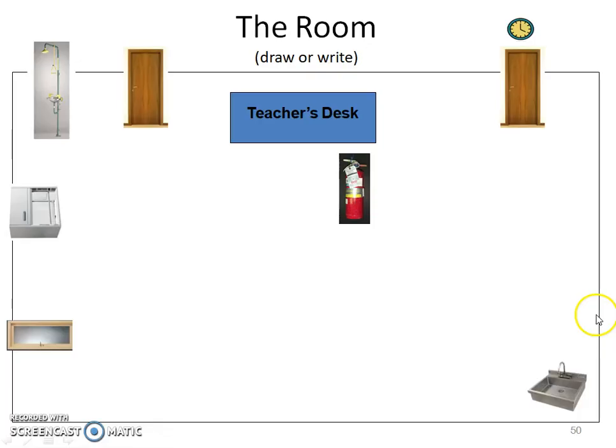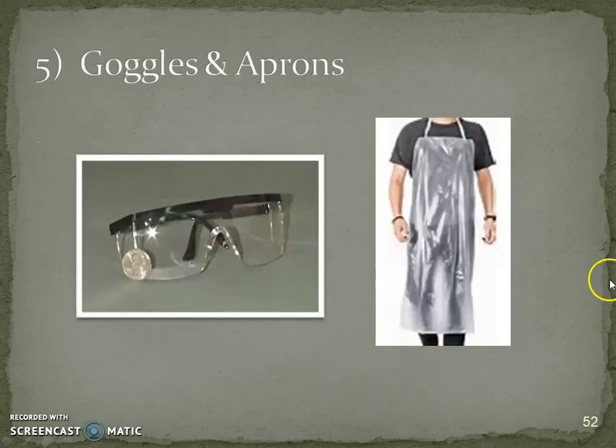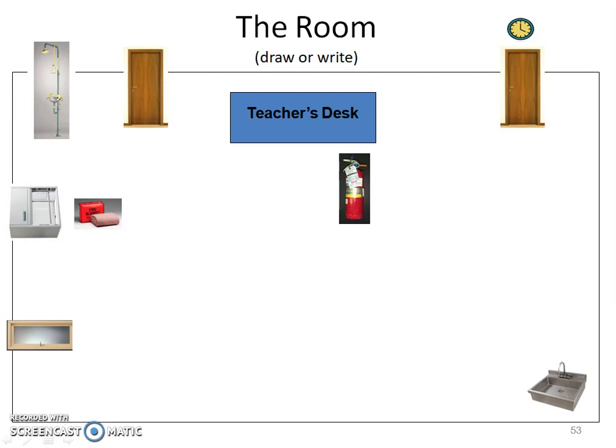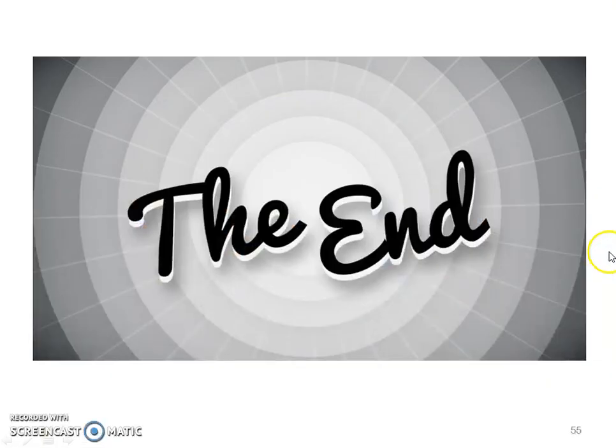The fire blanket is in a cabinet underneath the hood to the left of the teacher's desk. We use the fire blanket when a person is on fire: tell the person to stop, drop, and roll, then wrap the blanket around them. Goggles are in a white cabinet in the corner by the sink, and aprons are hanging nearby. We'll see you in class.